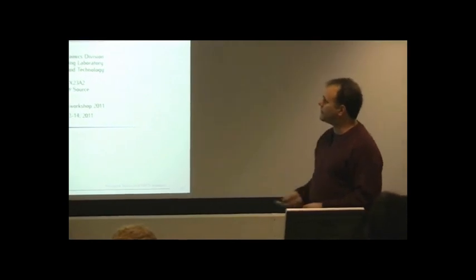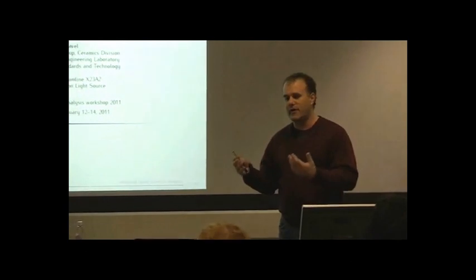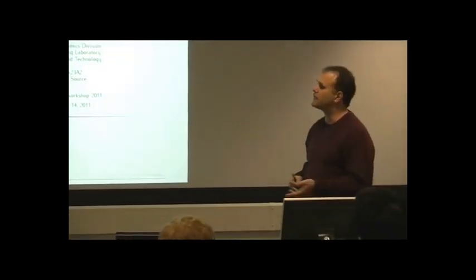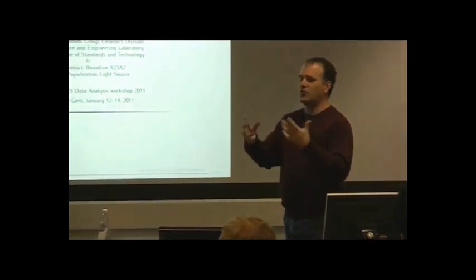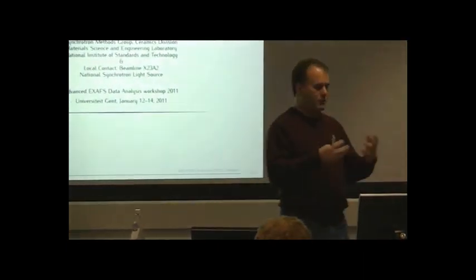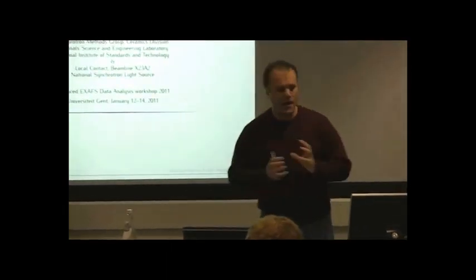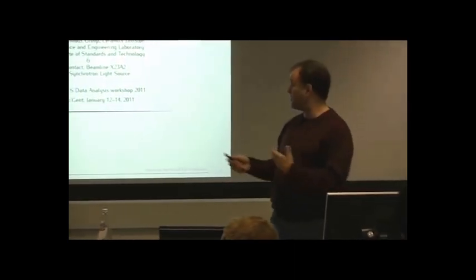And then the rest of the talk is an explanation of the various kinds of tricks and tools that are built into the data analysis software that will get you to the end, that will provide you with the tools that you need to effectively and cleverly and creatively provide a model for your data and hopefully interpret something out of your data.